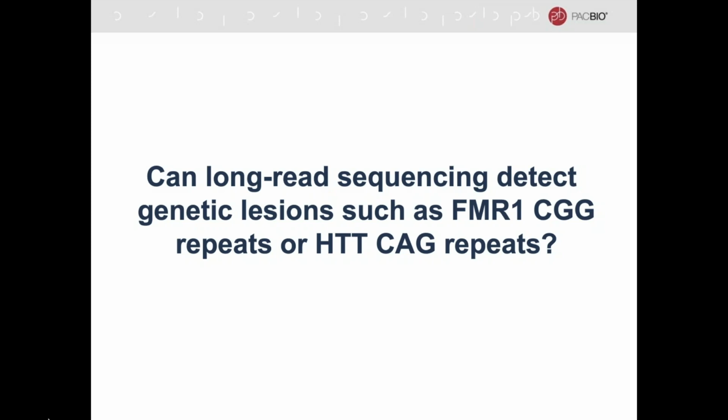With HTT, we've actually done it with an amplification method. So I think this is a nice way to segue into targeted methods overall. Often for your gene of interest, you may not want to sequence the entire 3 gig human genome to look at your one stretch of genomic content that you're interested in. I work in a lot of polymorphic immune loci with my own research. And so there's a lot of different target enrichment methods you can use.